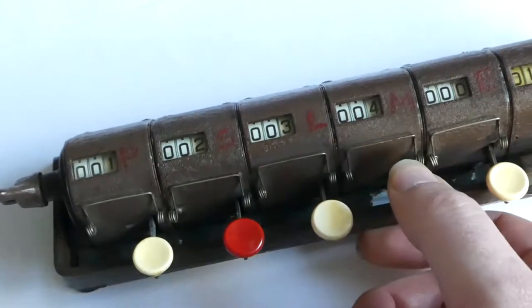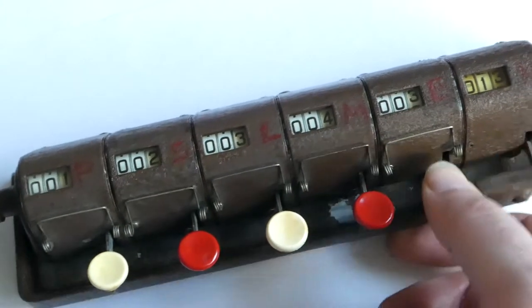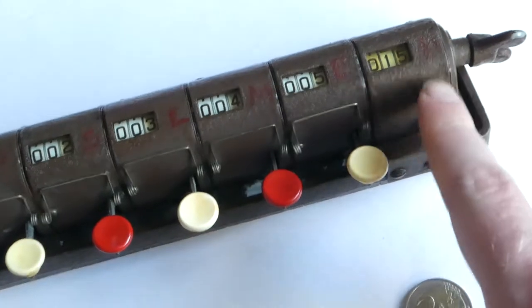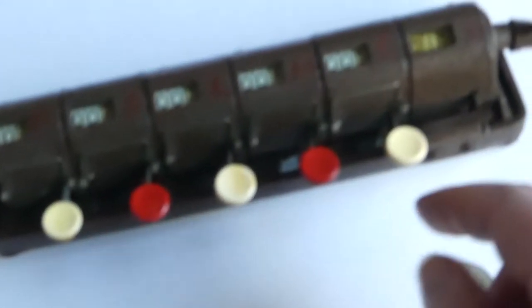Each has its own button, and this counter here is the total.